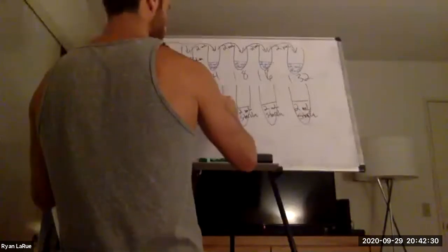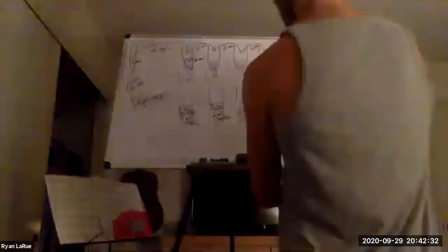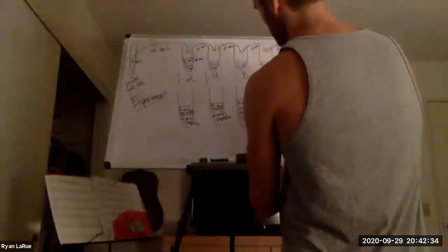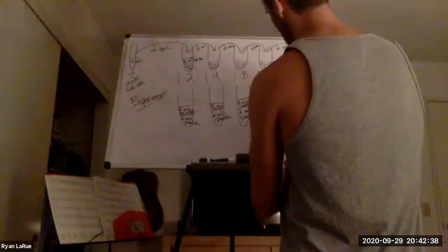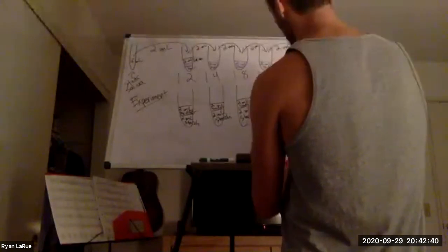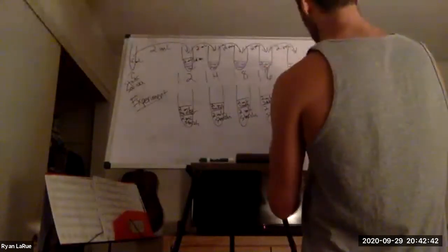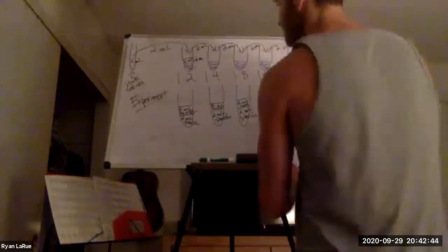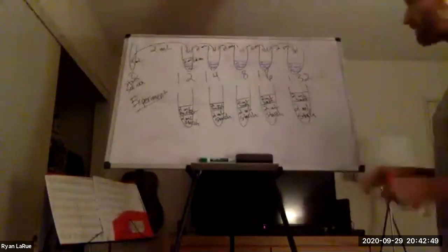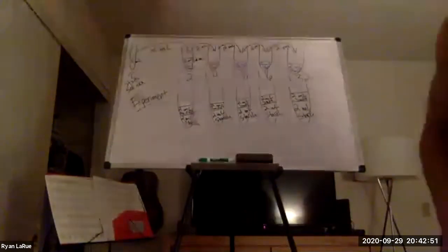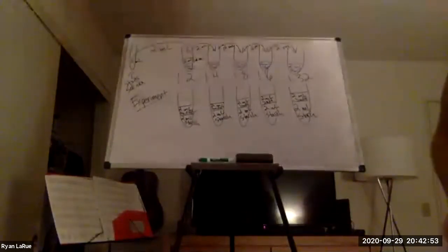You're going to add the buffer as well. So it's two milliliters of this pH seven buffer to each tube. Two mils buffer, two mils buffer, two mils buffer, two mils buffer, and two mils buffer. Obviously, this is not drawn to scale up here. It should be towards the bottom of our test tube. Okay.